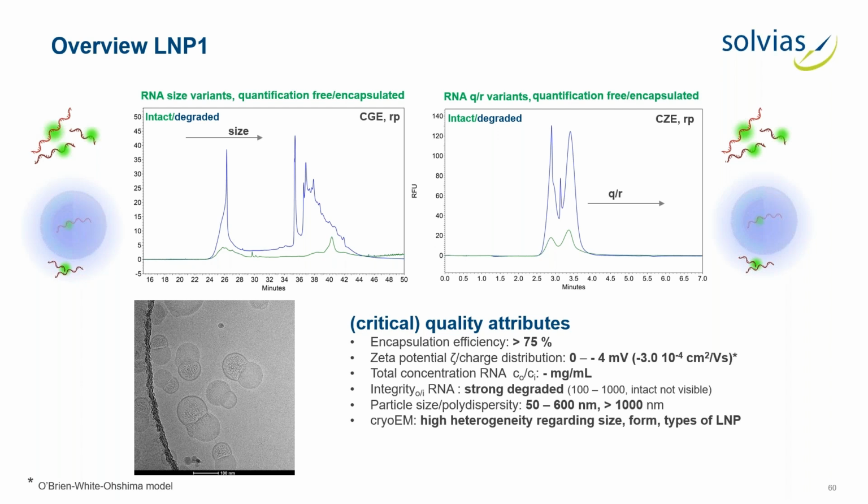And if we disrupt the LNP systems with the surfactants, it's clear we increase the signal when we analyze the total RNA. At the moment, it's quite difficult to say how to interpret the CZE of an intact particle. Experiments in particular, but the TEM image alone shows that it won't be a piece of cake.